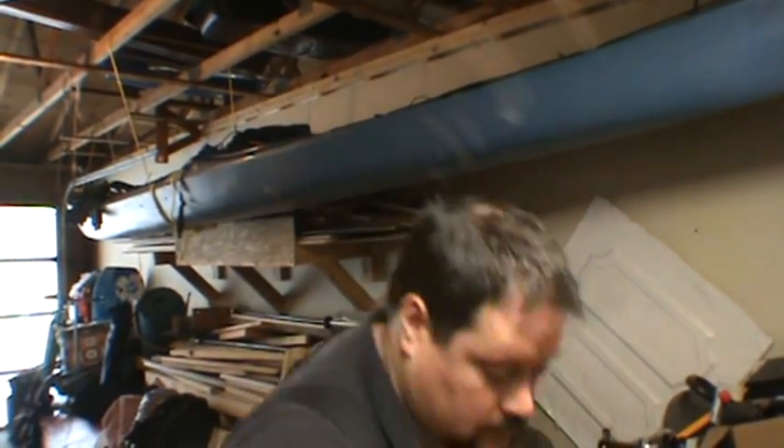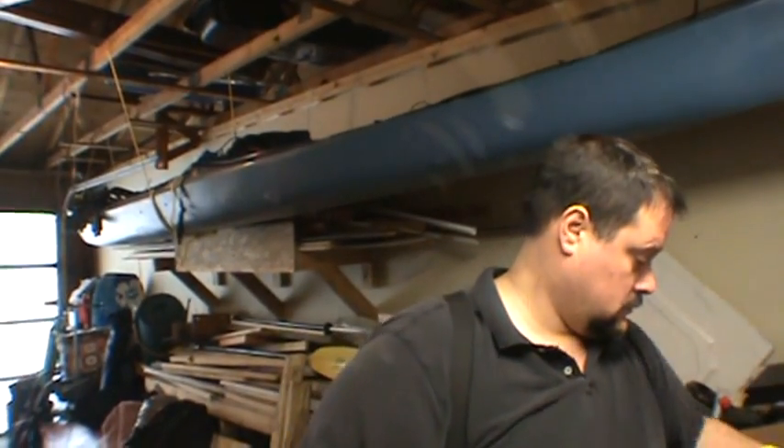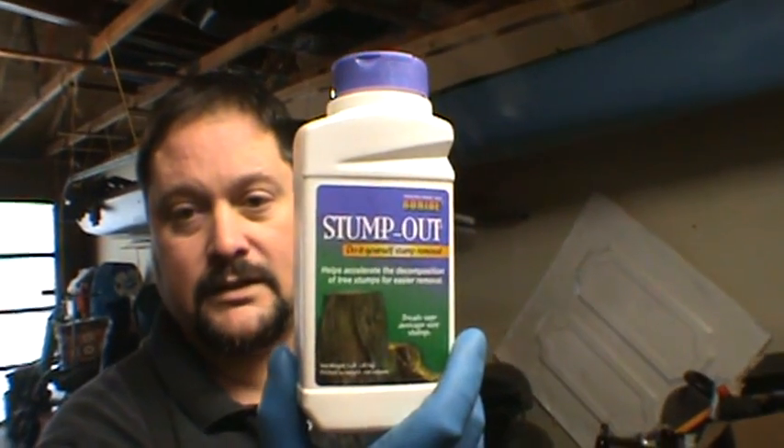So we're going to need three chemicals: we're going to need hydrochloric acid at 31.45%, regular household bleach, and sodium metabisulfite — or Bonide Stump-Out — which has sodium pyrosulfite in it, which will do the same thing.